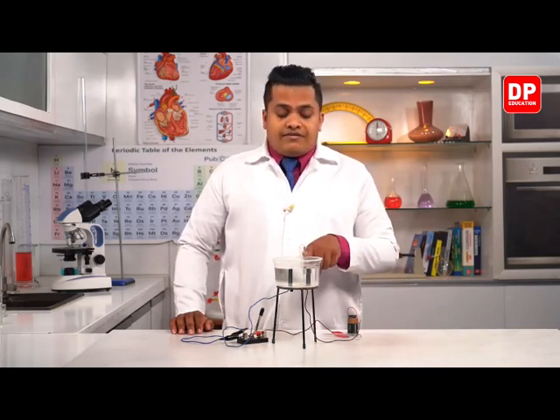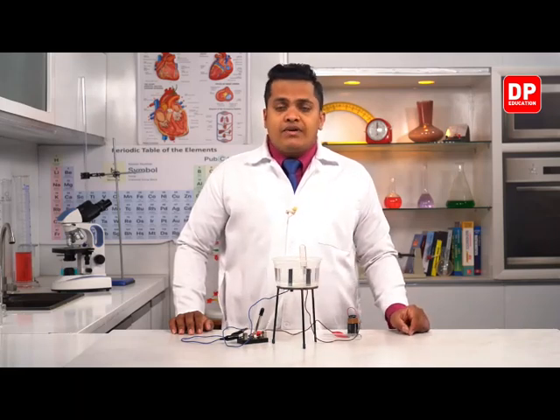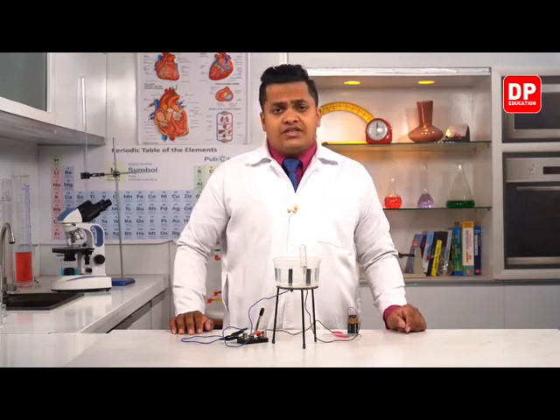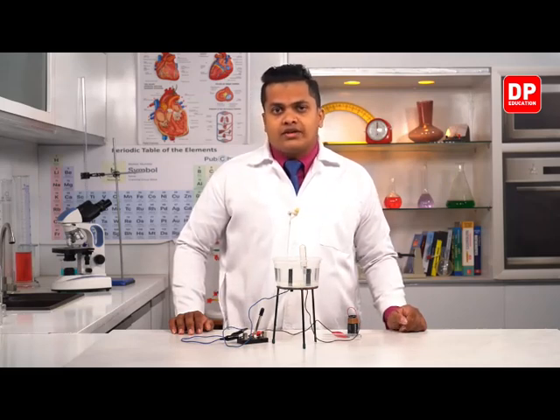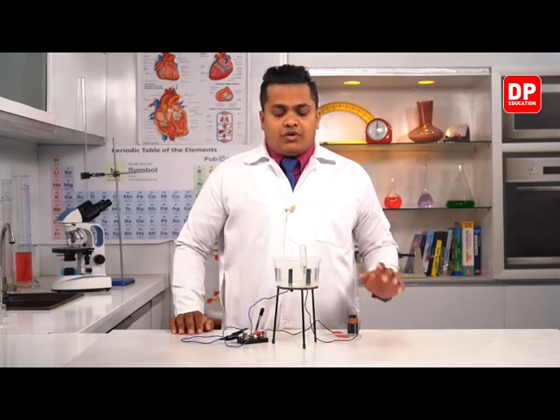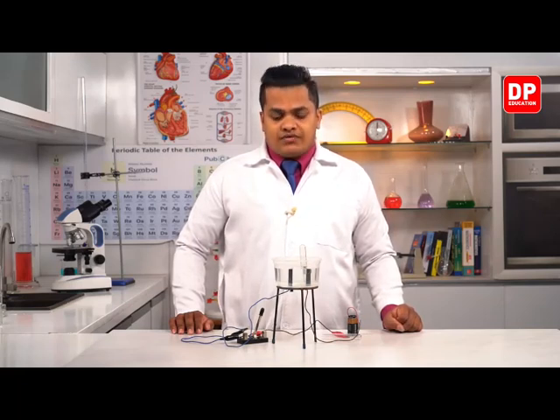Now, if I'm going to keep the system for a shorter time period, I won't be able to collect this much oxygen. The oxygen gas which is coming out from this electrolysis process of acidulated water is also very little. I told you that in the earlier case also, right? So I'm not going to do the experiment regarding the oxygen gas. However, you could clearly observe that there was hydrogen gas at the negative terminal.